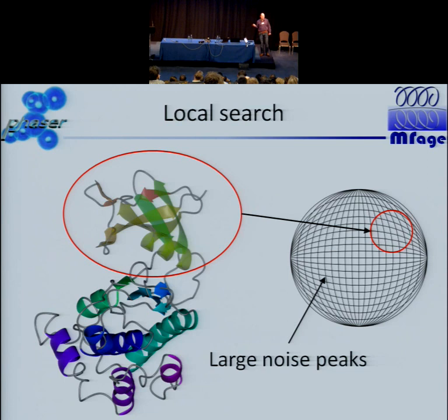So yesterday, Deborah was talking about solving the exosomal complex with such a technique, where she had a more complete model, which she superposed onto the known parts of the structure she had solved so far, and then located the positions for the other missing domains. And this is exactly the same thing. It is just automated.